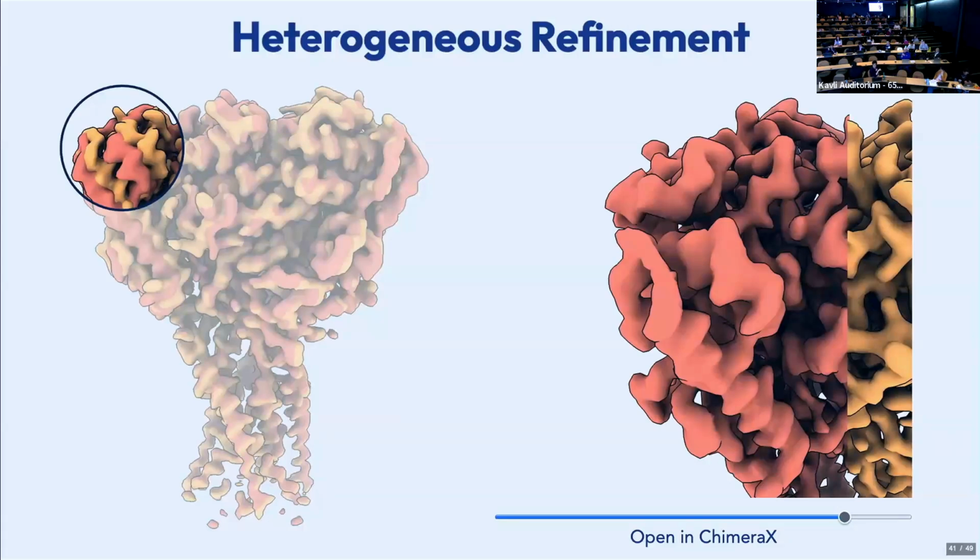Yeah, and just to add to that, I think that's a really excellent point. Especially from our maybe more selfish point of view, believe it or not, Structura does not have a Titan Krios. We don't purify protein and collect data, right? We rely on and really need data from the community, from places like SLAC and other places with microscopes, so that we can access data sets that help us develop techniques like this. We need cryo-EM data to develop the processes that work on cryo-EM data, and we can't generate that data.